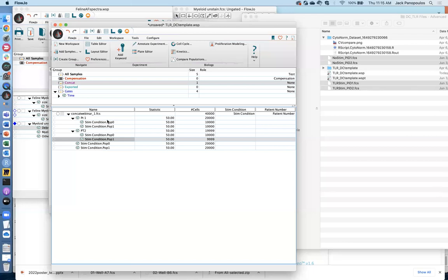So just again, the email is just FlowJo. So that's spelled FLOWJO, right? Just like the tab shows here, @bd.com. Just paste your comment that you have here, Alan, in your email, and they'll get back to you fairly quickly, and then they'll just set up a time to help you with it.